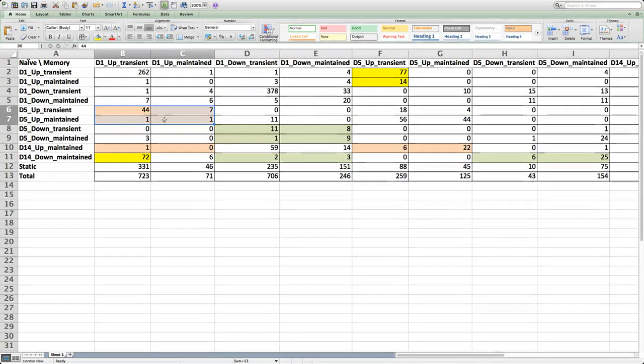And I mean, if I wanted to sort of deprioritize donor variability, then I could average all 4 donors in each time point. Or what I would actually do is fit a linear model with an intercept for each condition and just take the linear model coefficients. But I don't think it would change much.